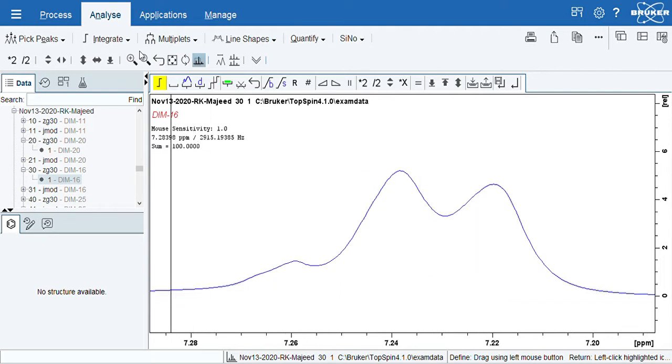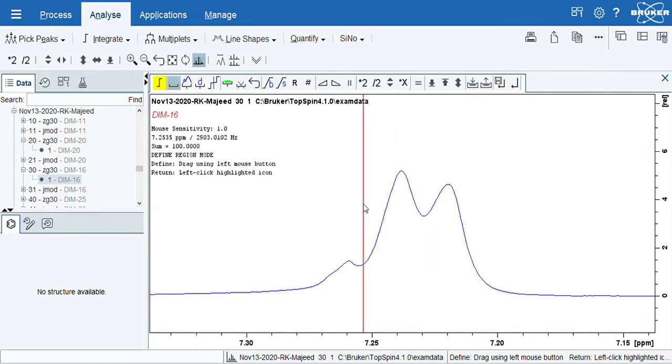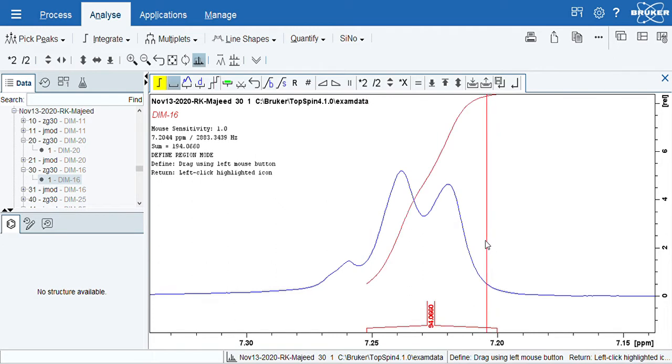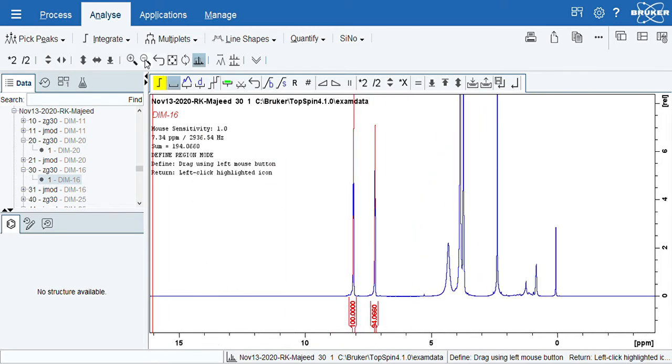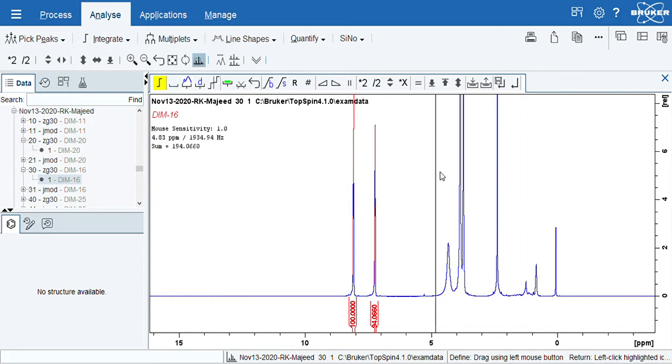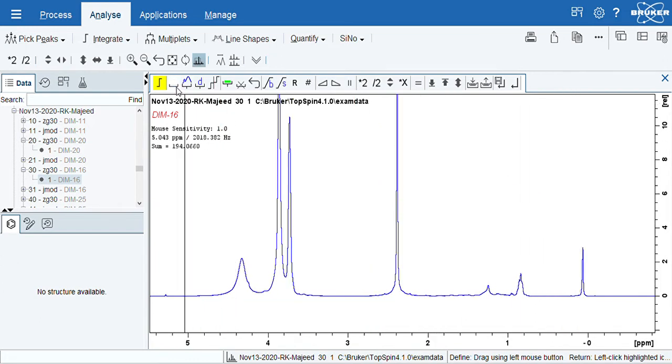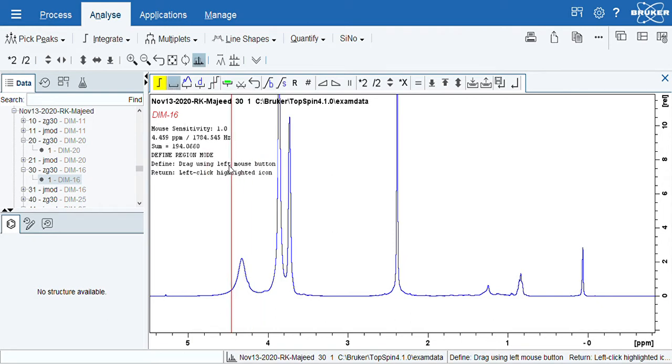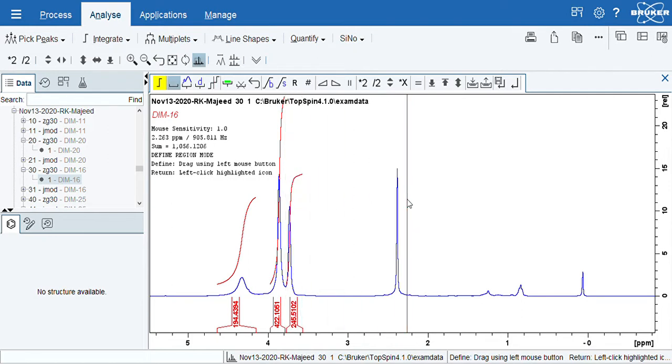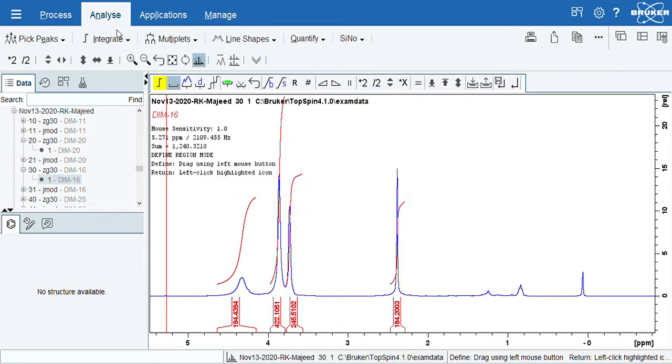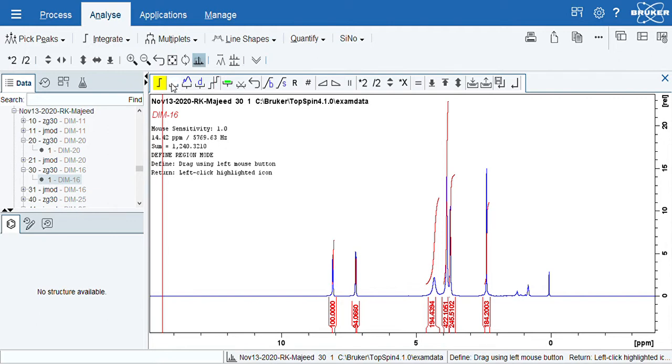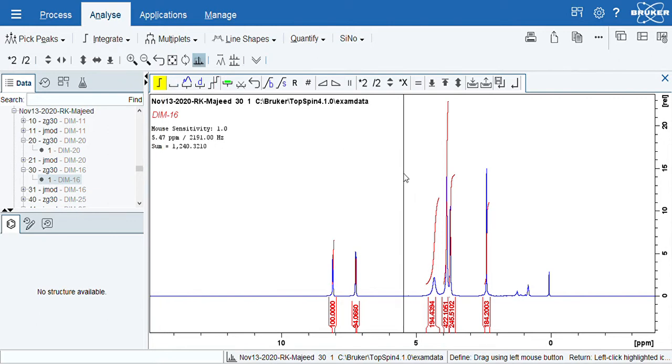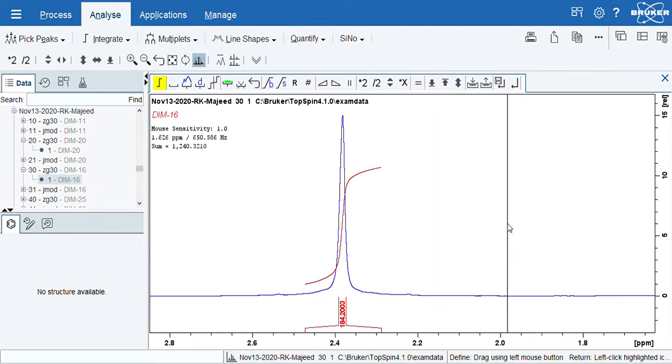I will follow the same thing. I am going this way, I am doing integration. So I know from my calculations, from the structure of the molecule, I have a methyl group which is supposed to come around 2.5.